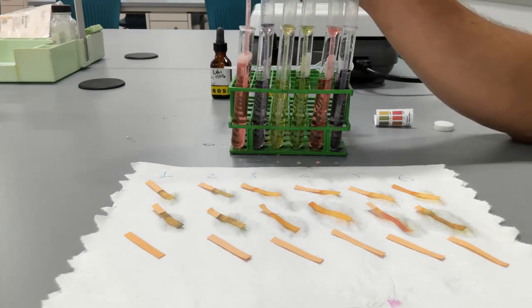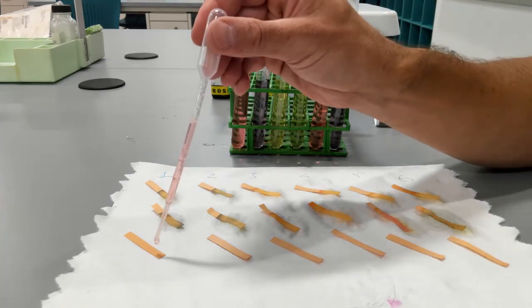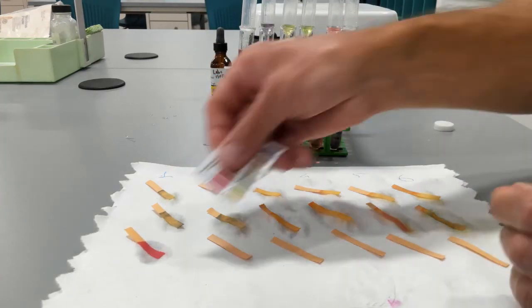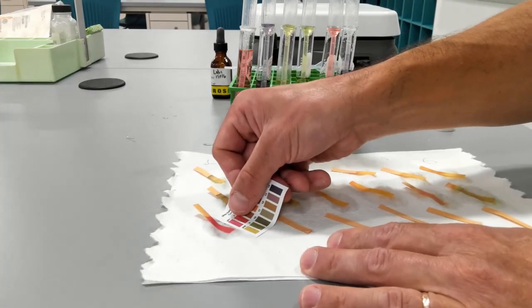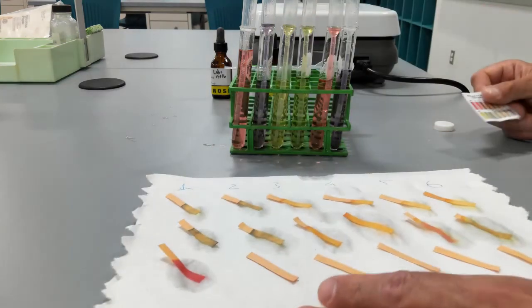We overwhelmed the capacity of the buffer to buffer it, and you see all the bubbles. That's carbon dioxide being released from the reaction. Now what's the pH? Well, I'm trying to center it, you can fairly clearly see that it's between pH 2 and 1.